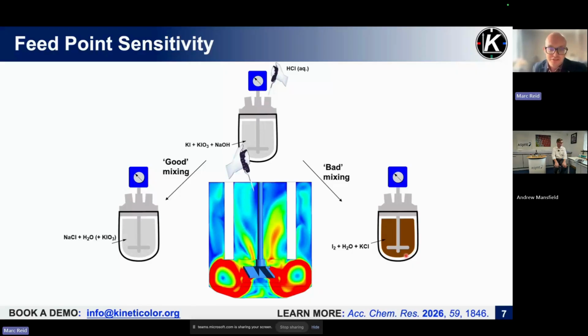If you look at this process through computational fluid dynamics and look at the sorts of tank reactors that we're interested in, some of which we've used from Asynt directly, we can model those reactors and look at the amount of power exerted by the overhead stirrer at various cross-sectional areas of the tank reactor itself. And for the uninitiated chemical engineers in the room, all we have to understand today is that the red portions denote a higher power exerted per unit area from the impeller, and the bluer areas higher up the vessel towards the surface show that the impeller and the mixing is not as effective at the surface as it is close to the impeller.